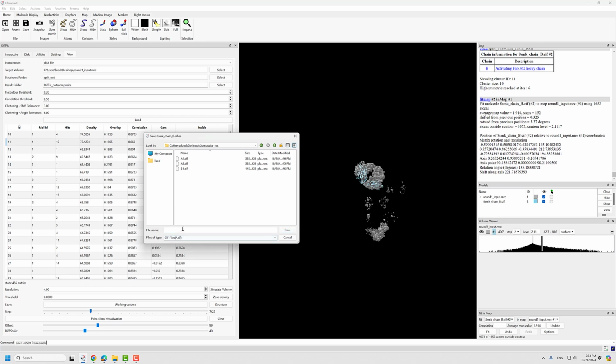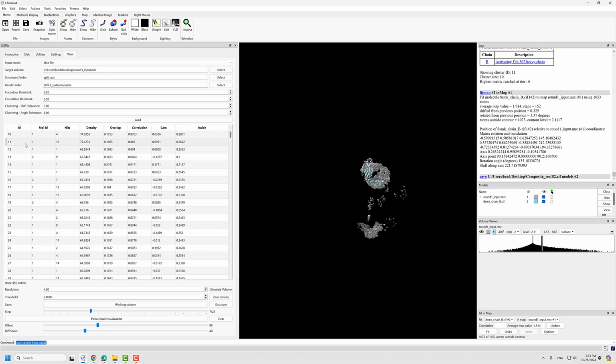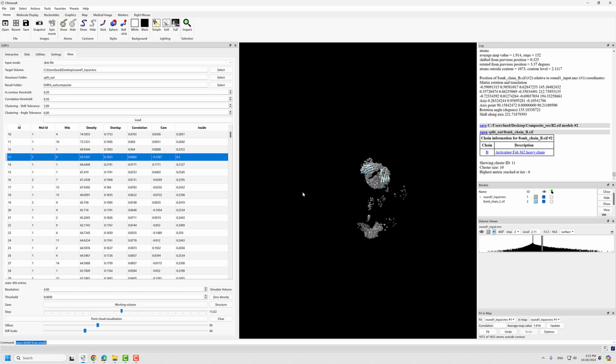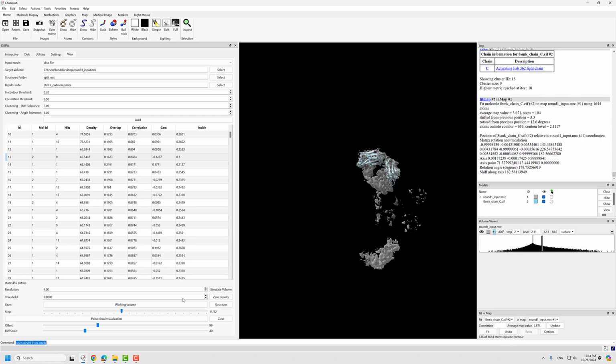B1 is there. Okay, this must be B2, and here we have C2.